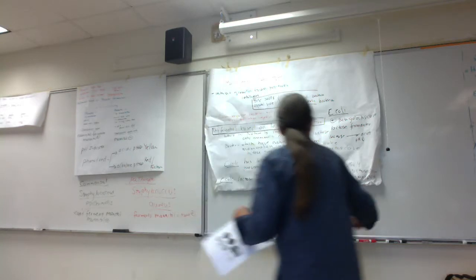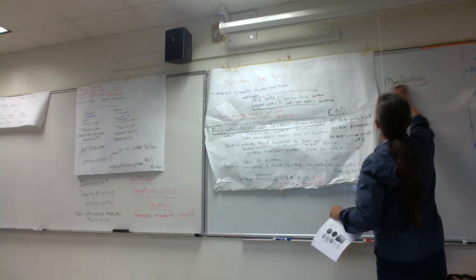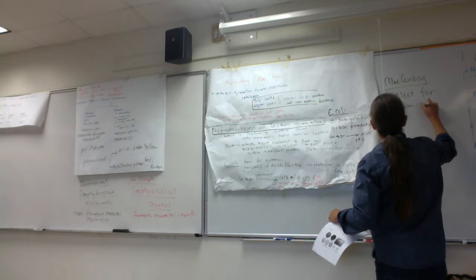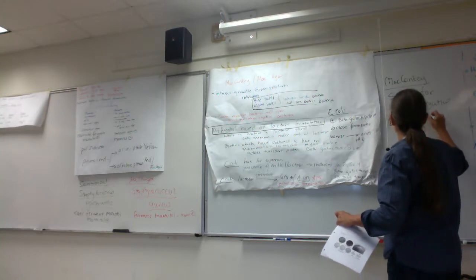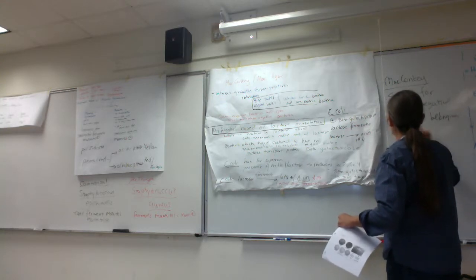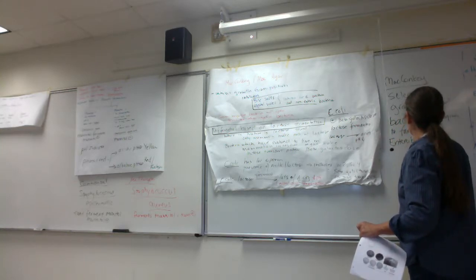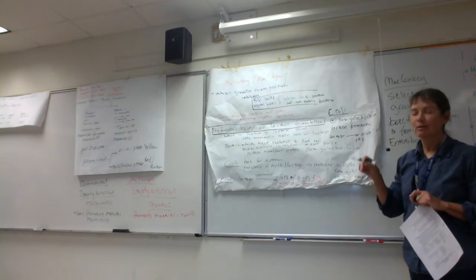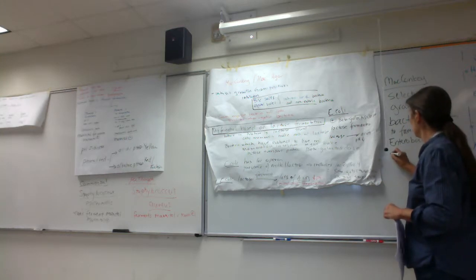And specifically, with MacConkey's, it's going to select for gram-negative bacteria that belong to this big family of bacteria called the Entero. Entero refers to intestines. Enterobacteriaceae. And indeed, most of the gram-negative bacteria we work with here in our lab belong to this big family. The most famous member is good old E. coli.